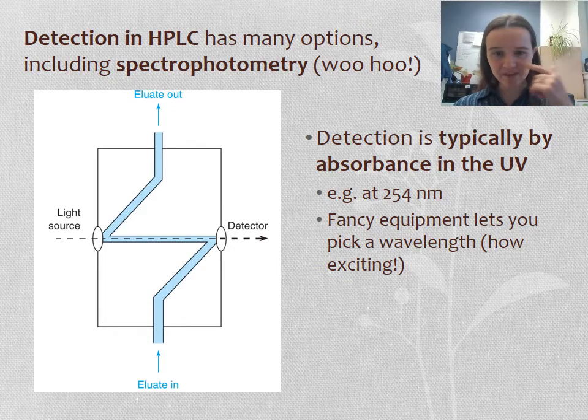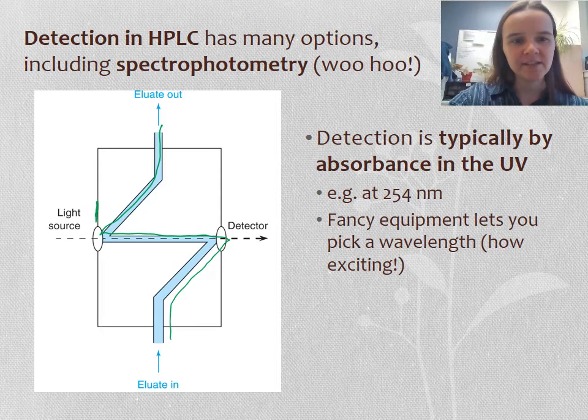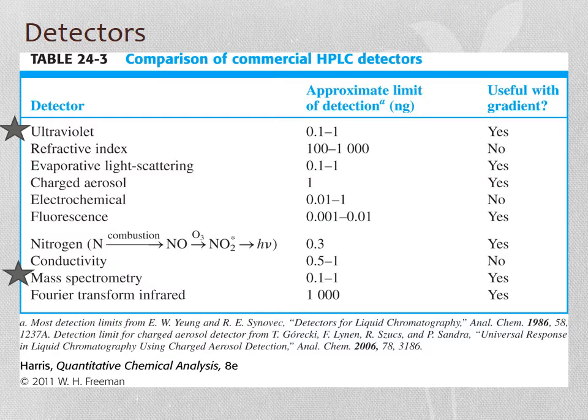And the clever way that they came up with this is to actually have the path of the liquid bend and then go on out. So this distance here from end to end across the bend, you've got little windows, and so you can pass the light through from left to right across that particular length of the capillary. And that length is your path length for the spectroscopy and allows you to get enough detection.